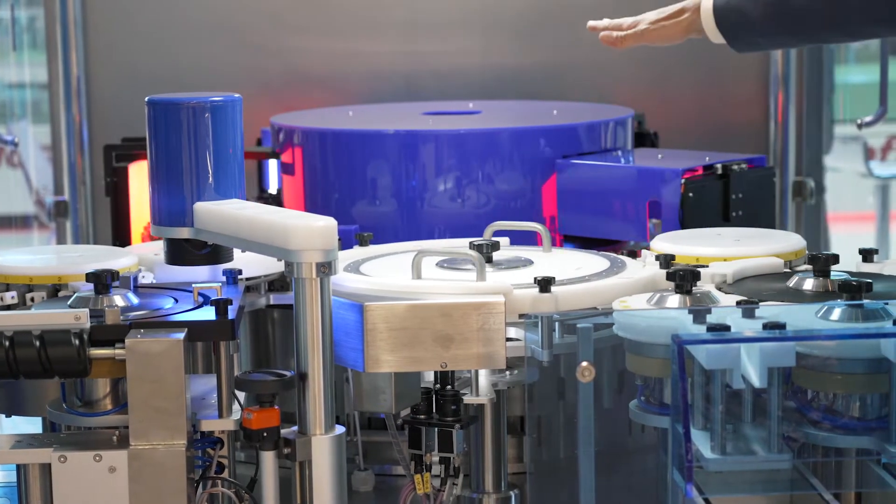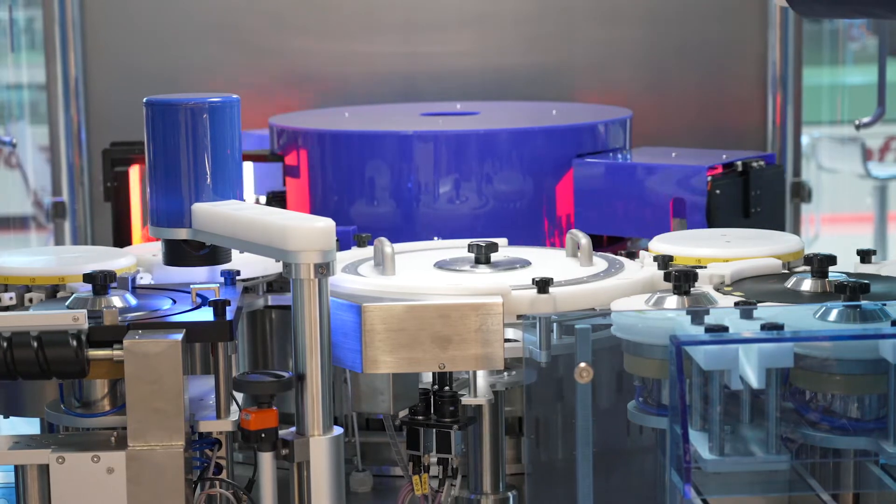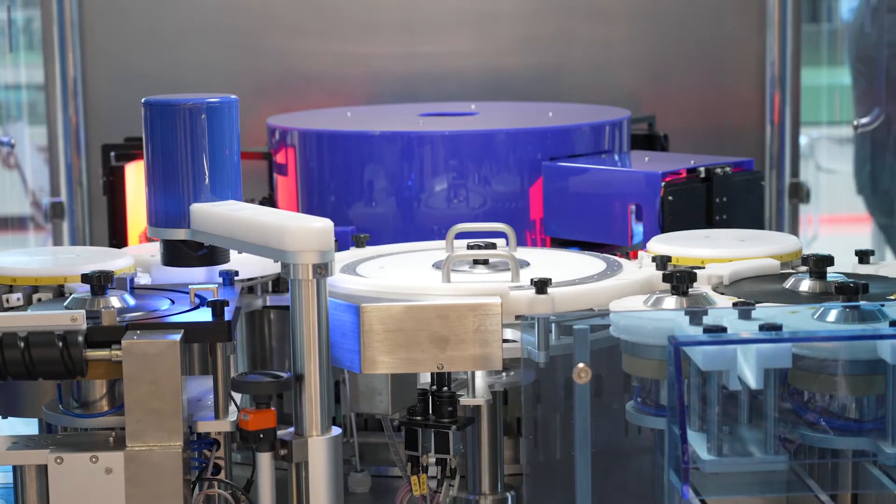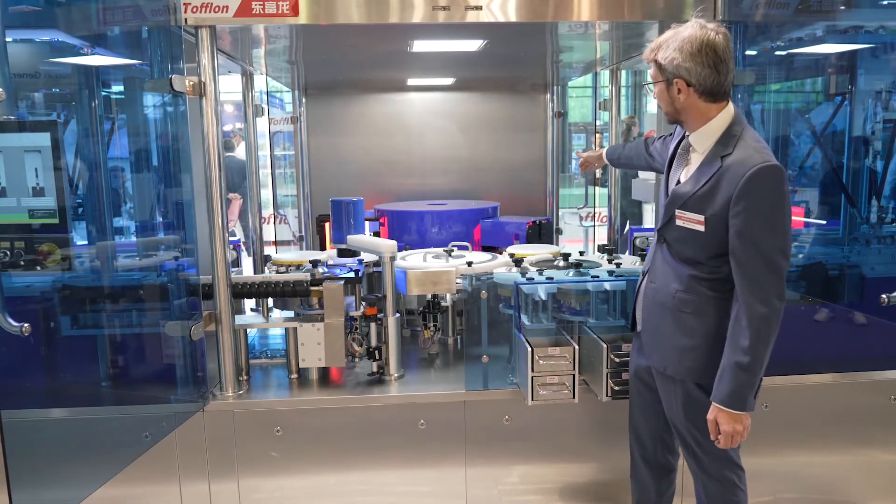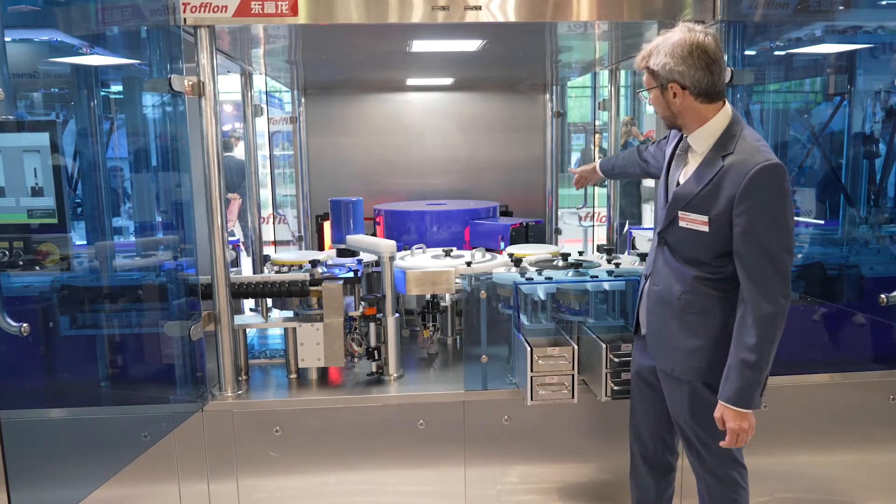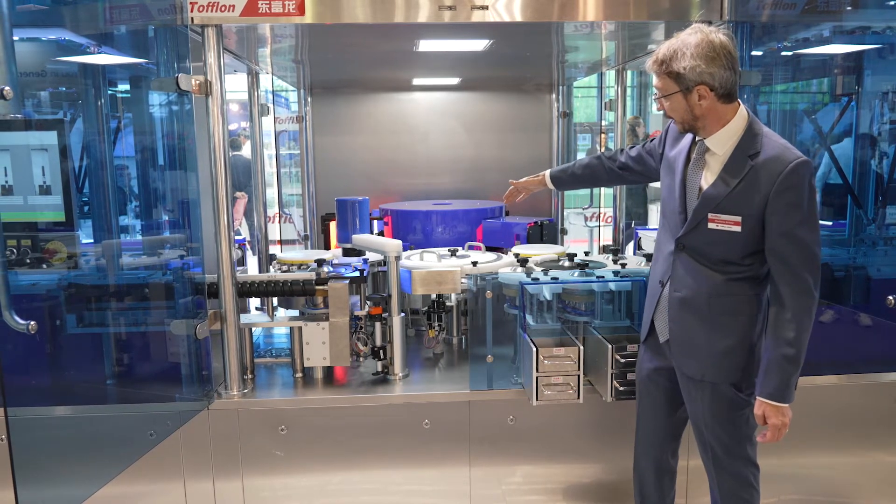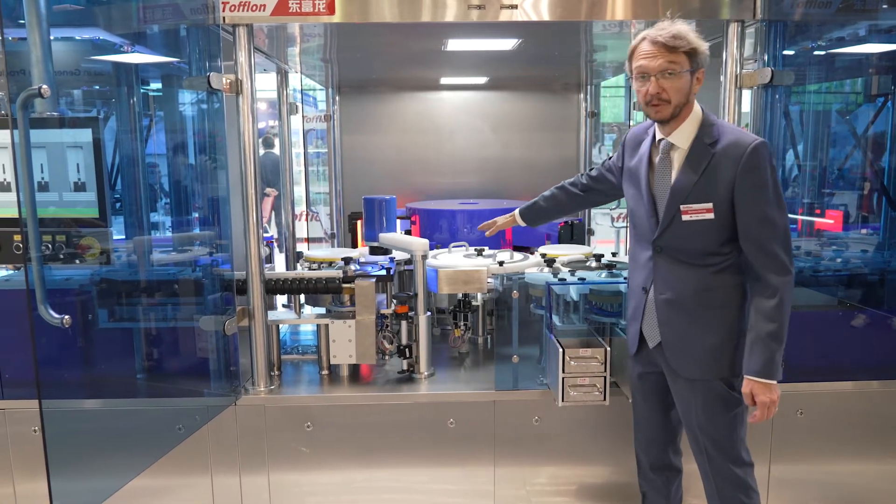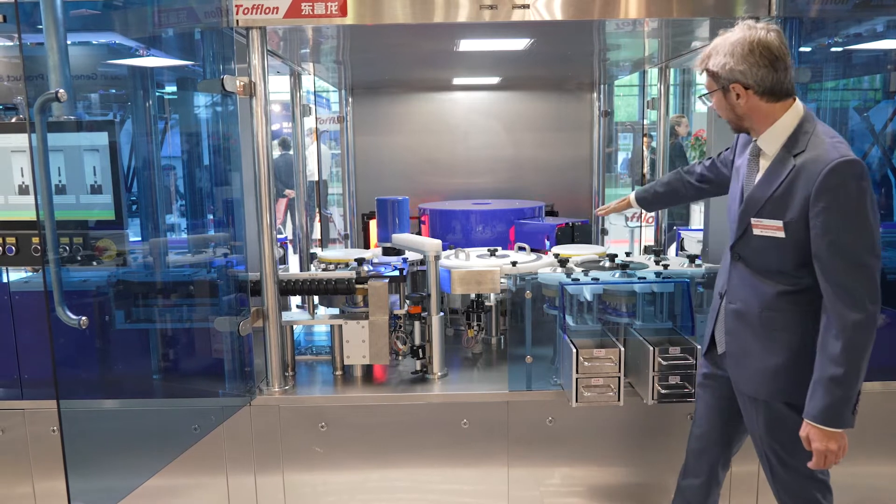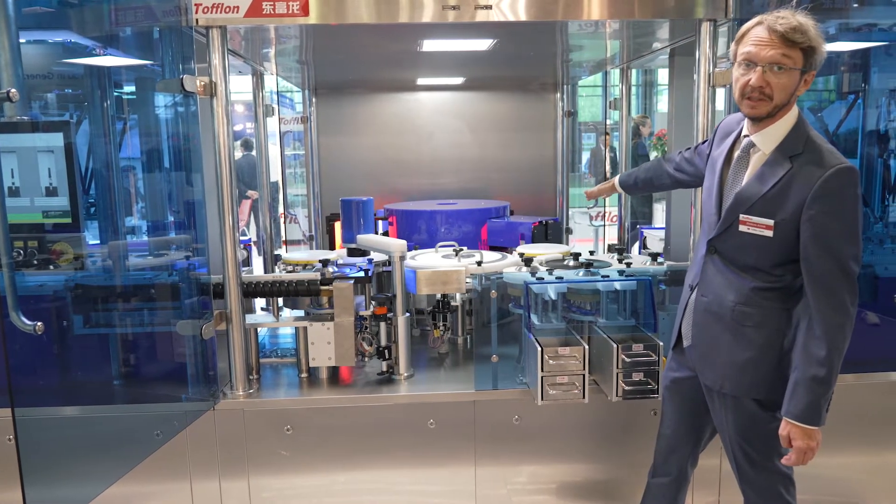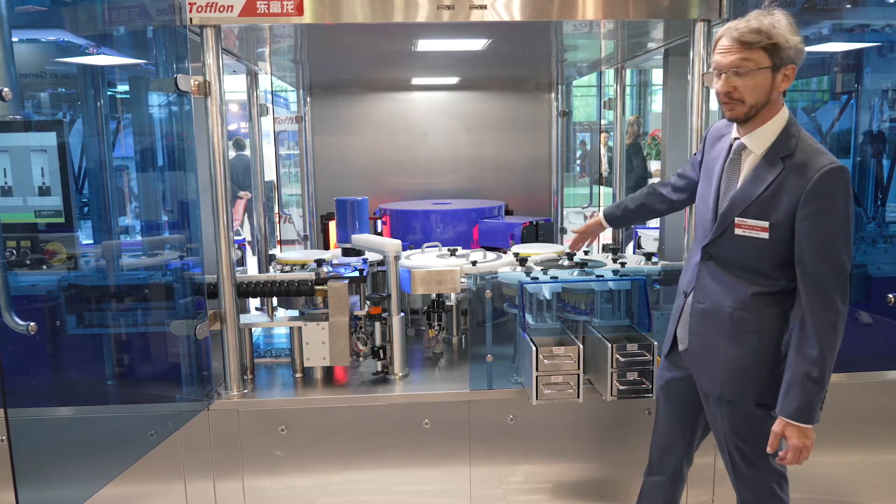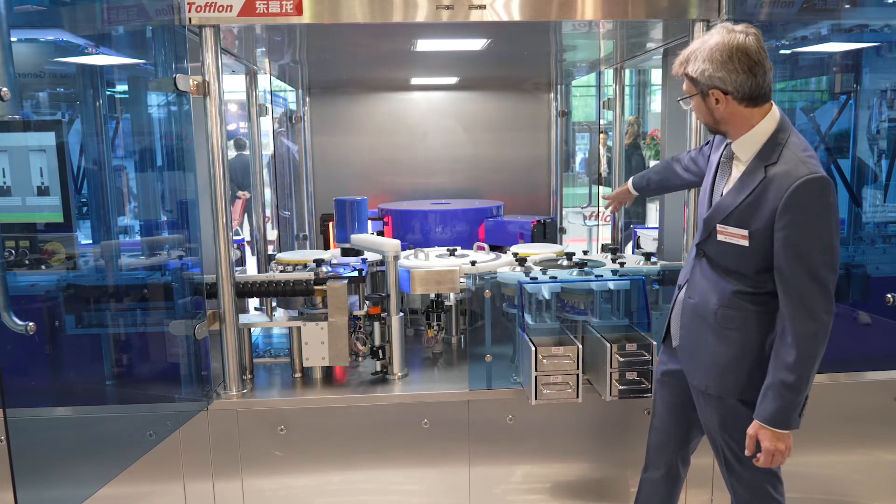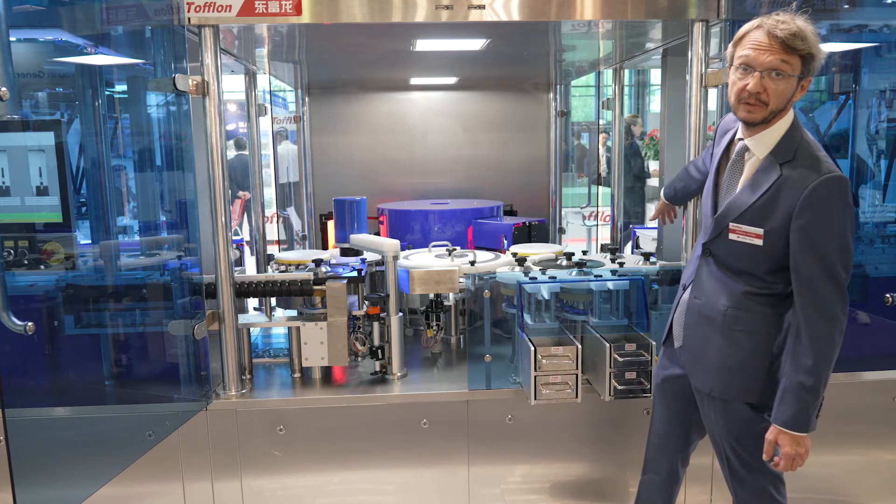We have the first station for cosmetic, the second station is the first particle inspection, then we have a needle shield inspection, and then we have the second particle inspection. Then the syringes are coming out. They are checked once more for the bottom here, and then they are turned again with the needle up. This is the sorting area where the rejects are removed from the stream, and then the good syringes can move on to the next step.